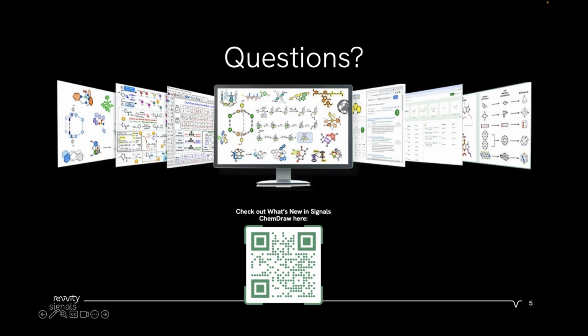That's the holy grail of chemical searching right now: can you lift something off of a flattened file and then interpret that chemically? Not quite there yet. So really restricted to the office files, your SD files, and your ChemDraw files that have chemical structure content pasted in them.